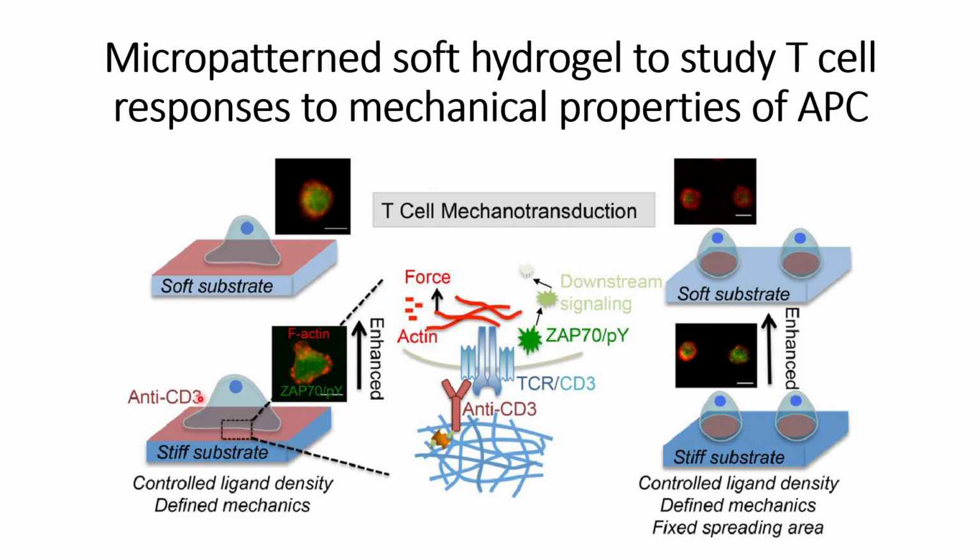We will see in the paper whether they have multiple examples or not, but from this they are able to point out that one can use different ligands to biofunctionalize this hydrogel so that they can study the interactions of their cells of interest with those ligands biofunctionalized on the substrate.